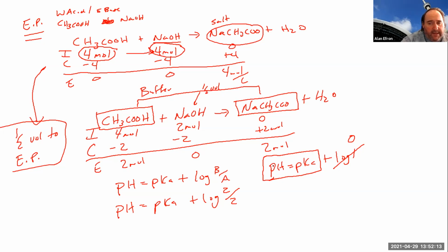So this is why in a titration curve, especially in a weak acid, strong base titration, or even like a strong acid, weak base titration, that sort of beginning part of your curve is really crucial. Obviously, where your equivalence point is also very crucial. But because you need to kind of go back and figure out at half that volume, what the pH is, because that will allow you to get to your pKa value of your weak acid. Any questions on that?